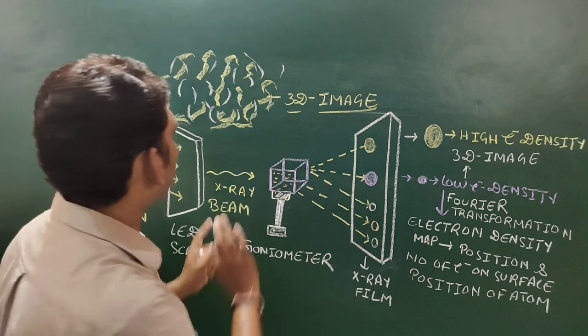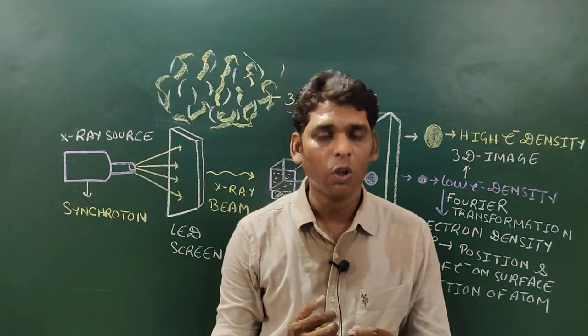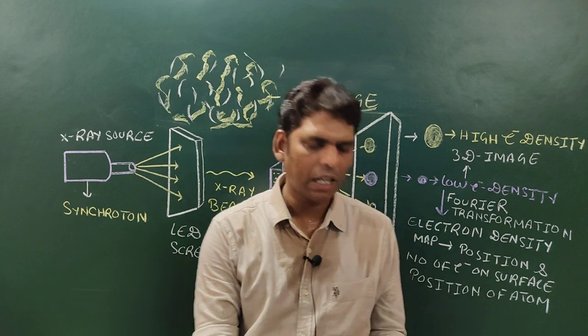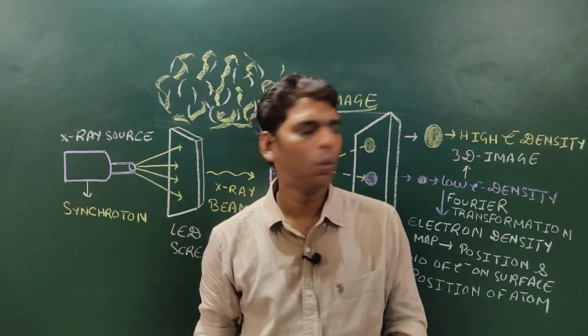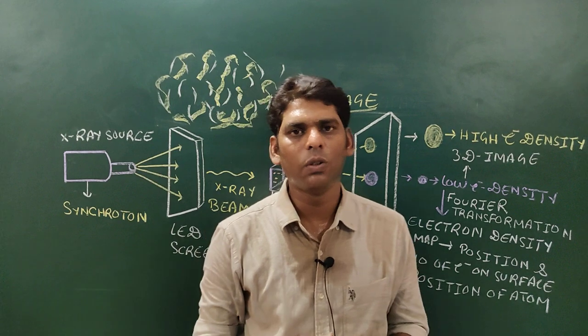Okay friends, so this is about X-ray crystallography. I hope this overall discussion will help you to understand the XRD. Okay friends, we have understood why we are using the X-ray beam, why we are using a crystal, and what is the difference between XRD and NMR.